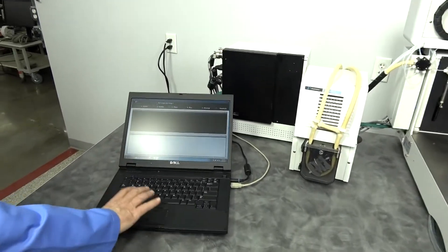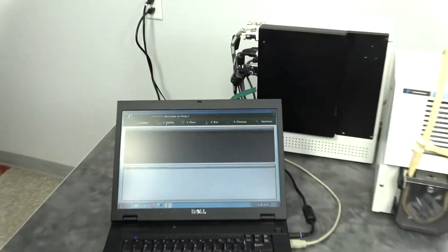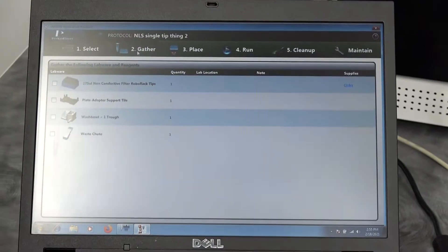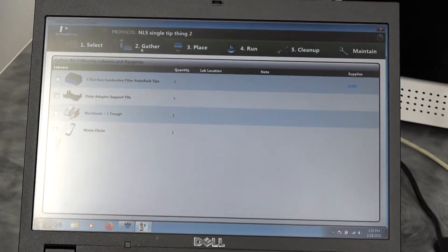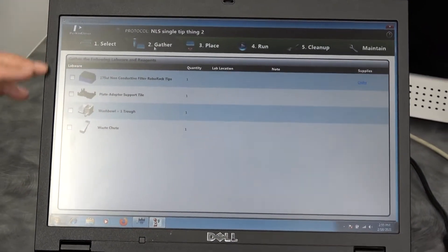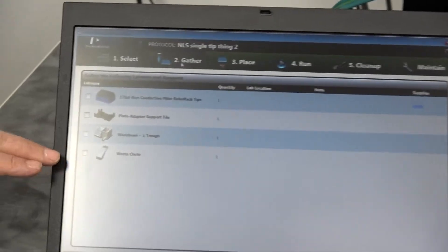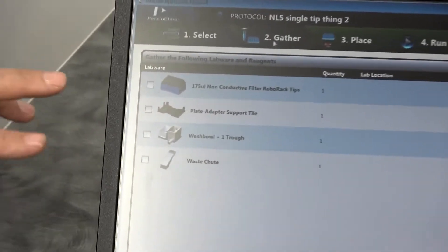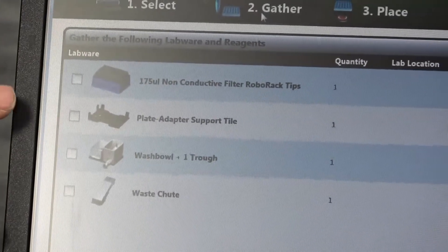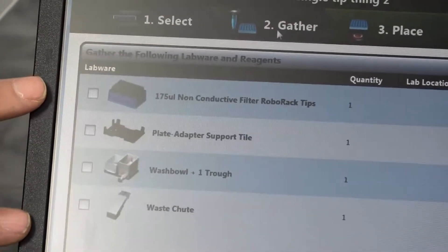Here we're in the select protocol menu. We can go into the gather section, which tells the end user what deckware they're going to need to gather and assemble for the deck.